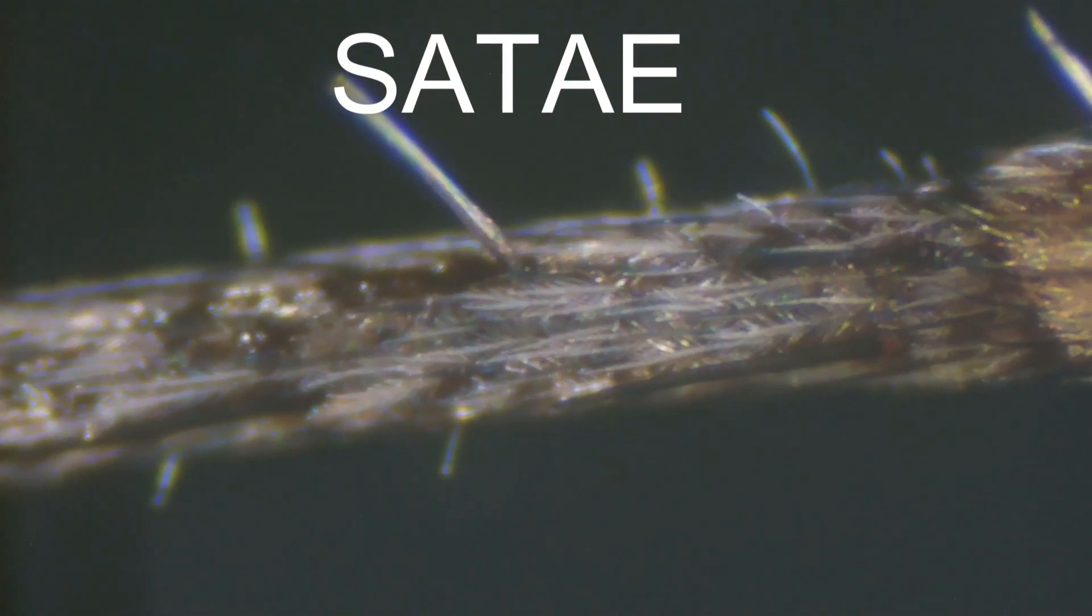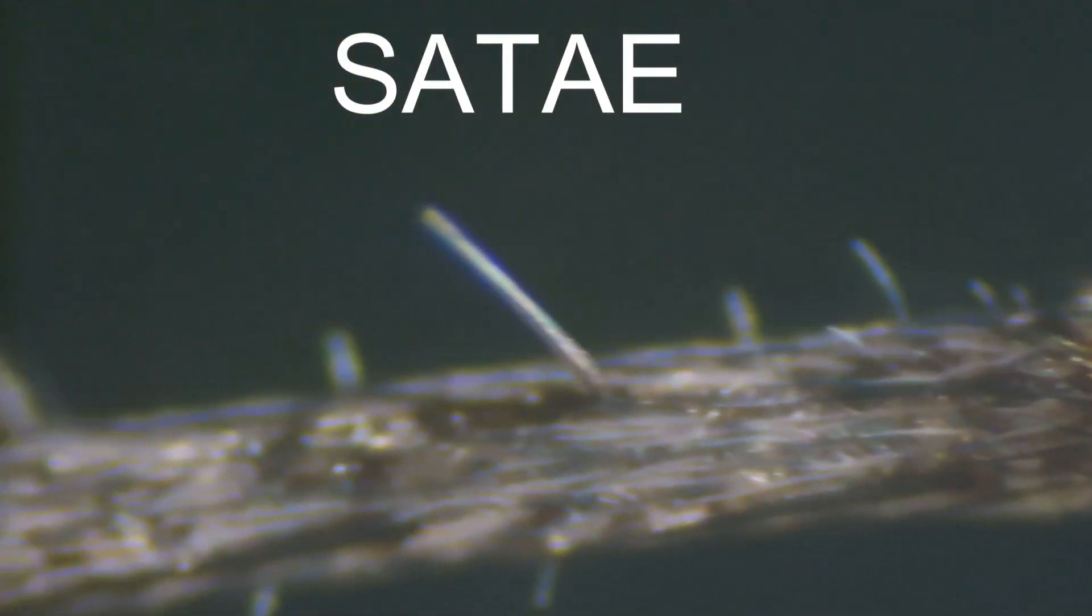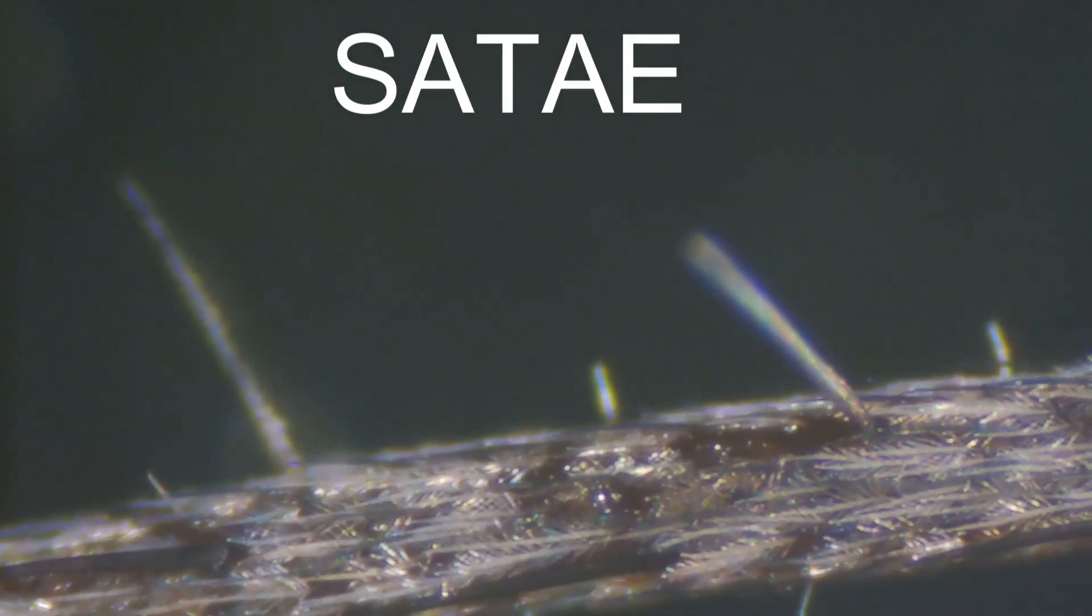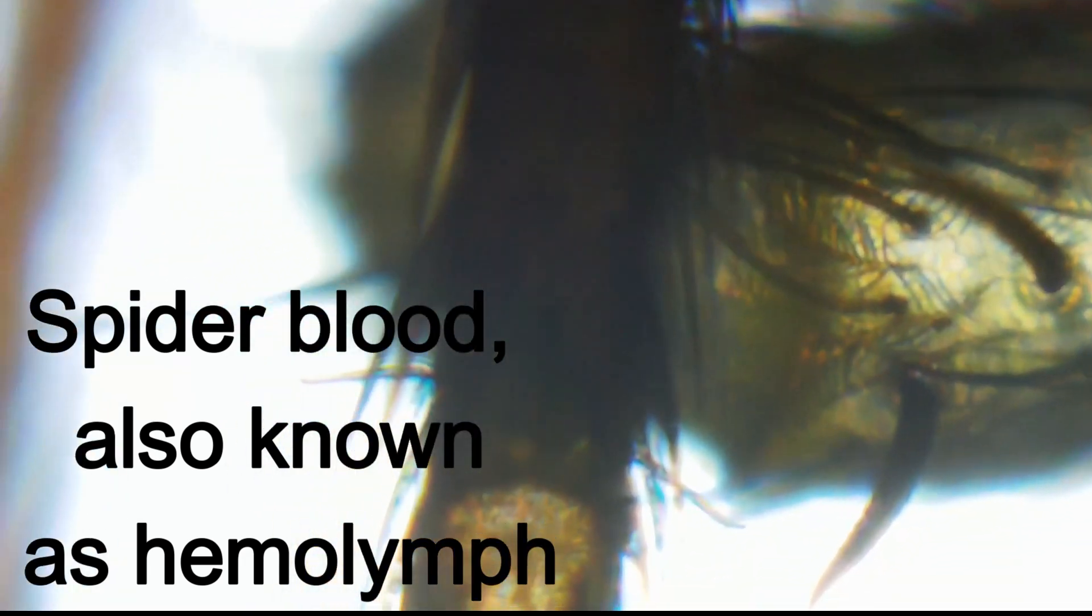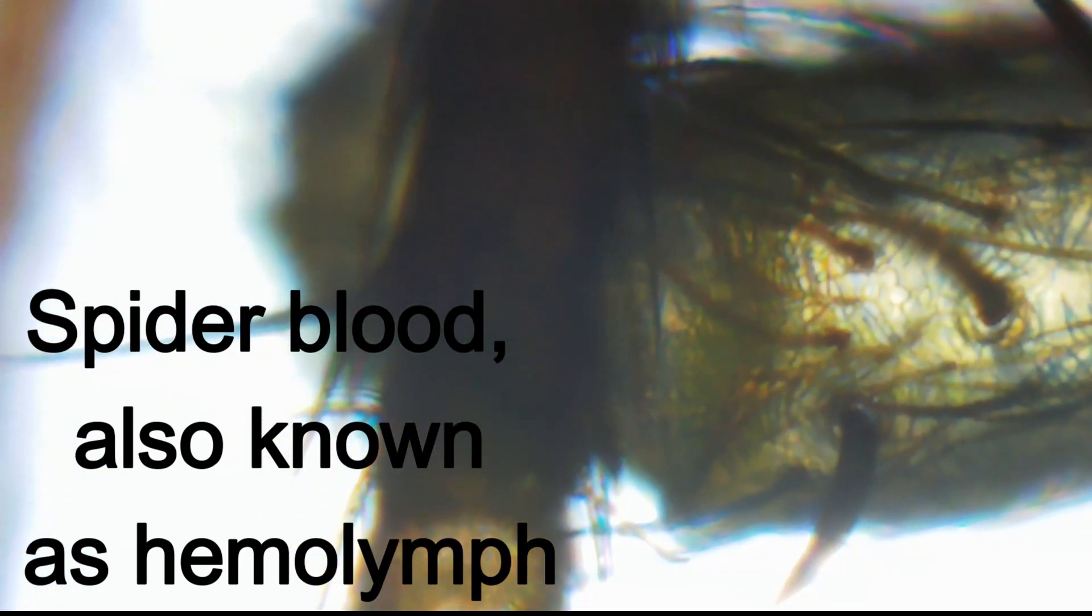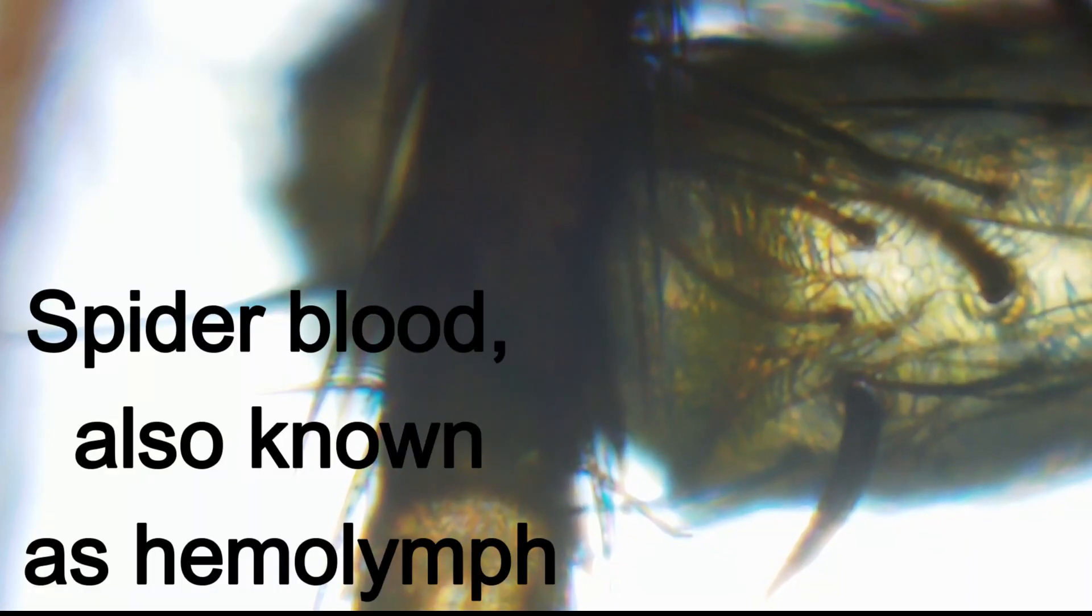Its eyes, eight of them neatly arranged, seem like tiny black beads on its head. Yet, despite having so many eyes, the American house spider has poor vision. It doesn't need to see you well because it lives by touch and vibration.